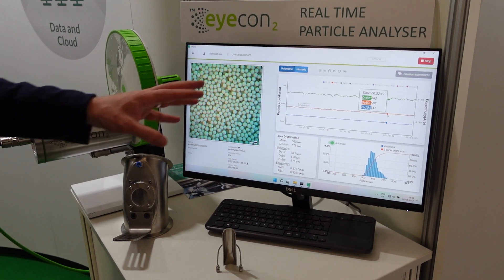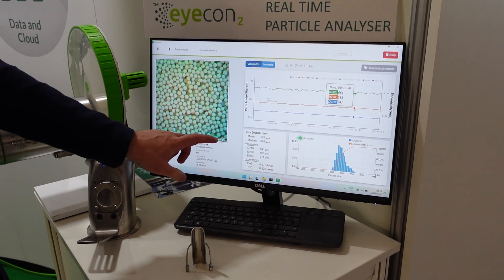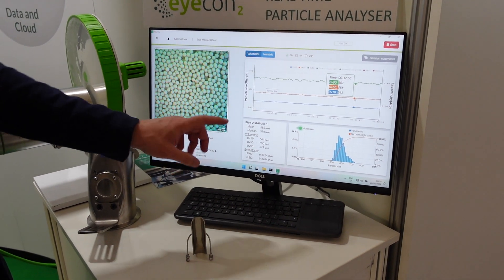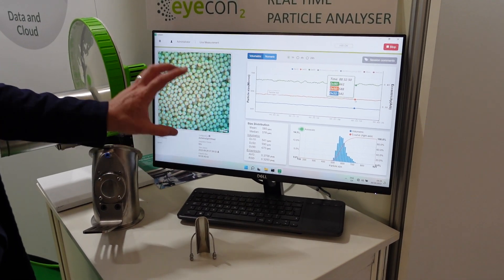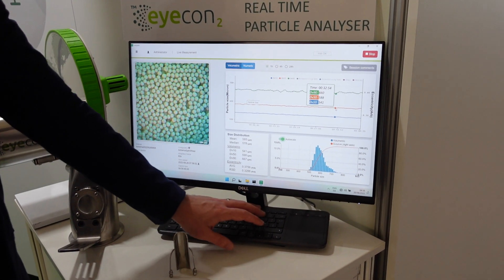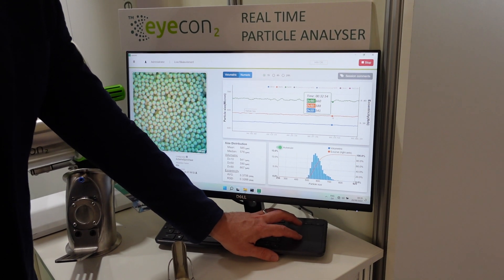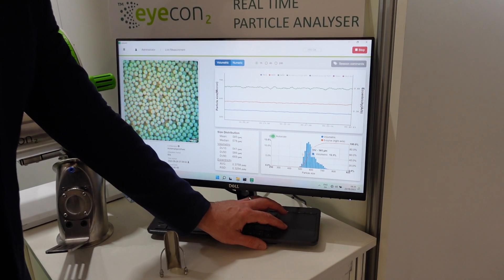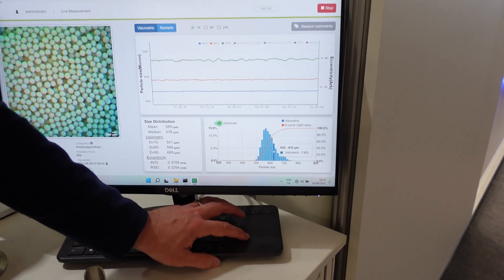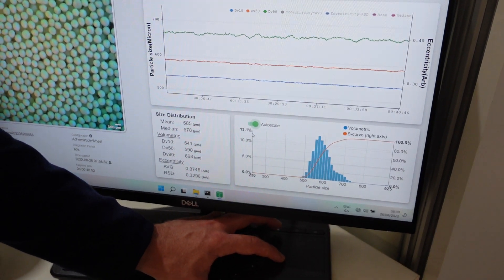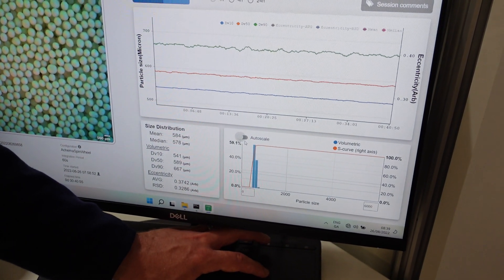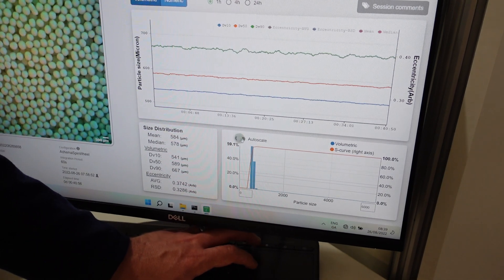A few of the new things about version 3 of the software: we've added scale bars that are customizable to any size you want, so you can get a gauge of the size of the material in the image area. We've also added an auto-scale to the x-axis of the distribution bar. If I click that, you can customize it to zoom in on a feature of interest.